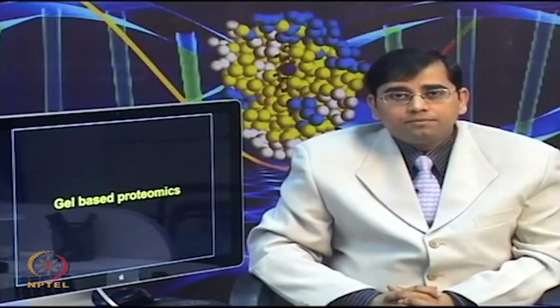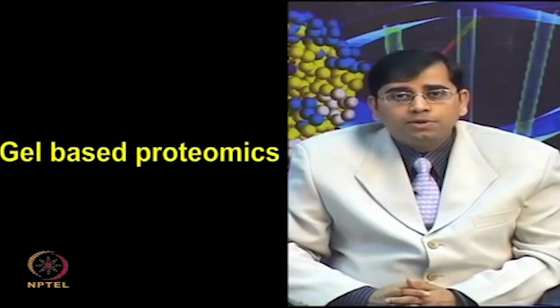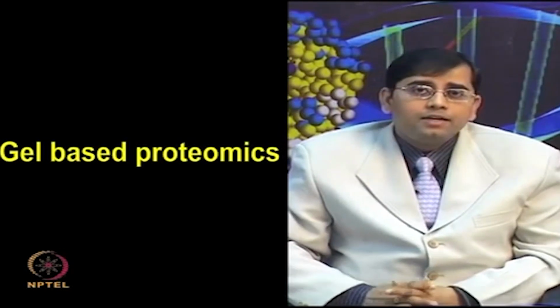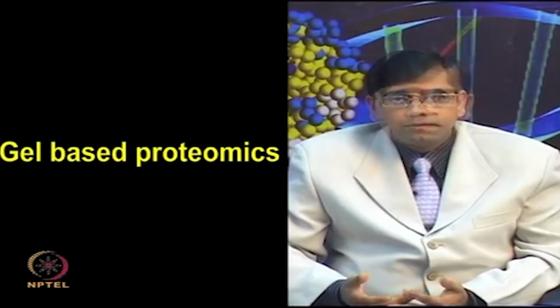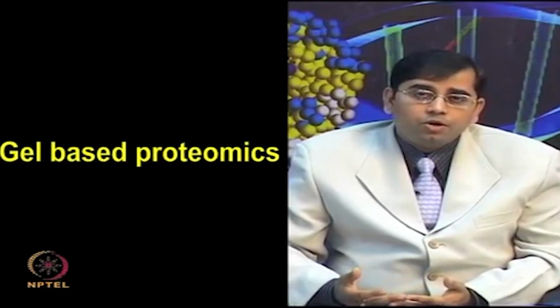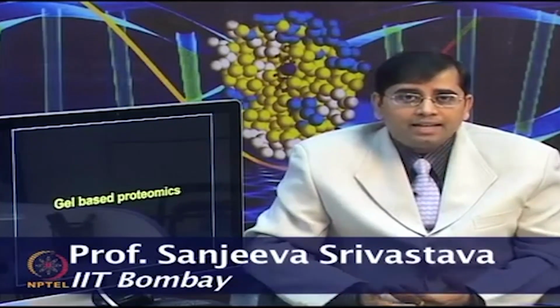So, we will continue our discussion on proteomics, and now since you have prepared a good sample, it can be applied either for gel based proteomics approaches such as 2-dimensional electrophoresis, or it can be used for gel free proteomic approaches such as mass spectrometry. So, we will continue our lecture on gel based proteomics and then demonstrate how you can use your prepared sample further for analysis of complex proteomes such as serum proteome, bacterial proteome and plant proteome.